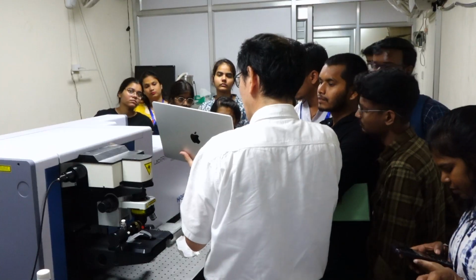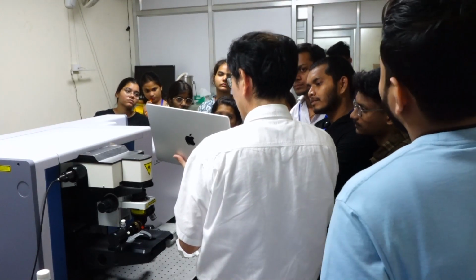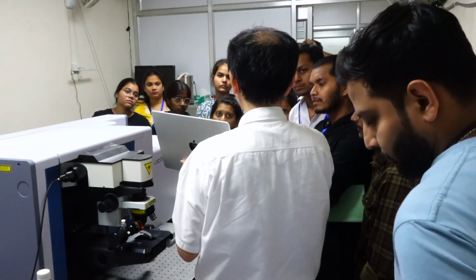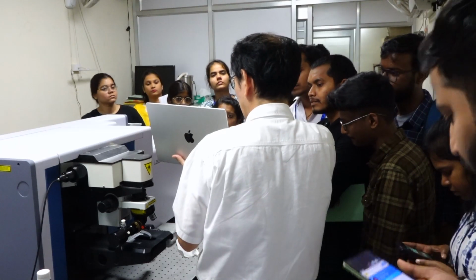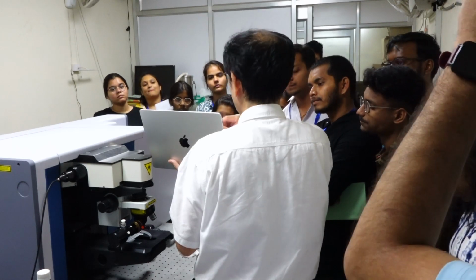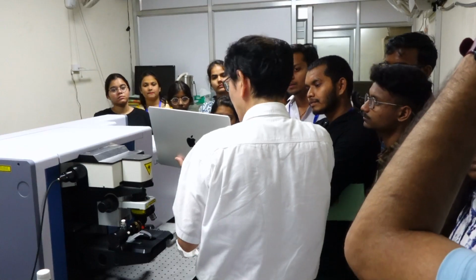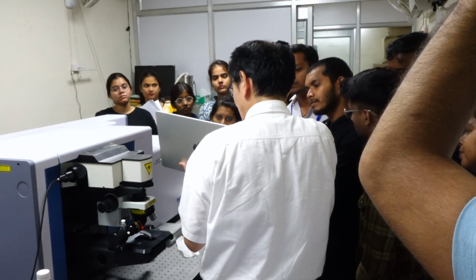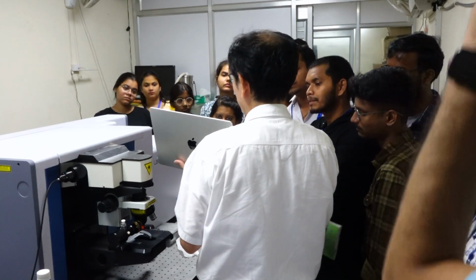Okay, and already we can distinguish the difference between these two sugars. But please be patient for a few hours to get a better spectrum. Then we can discuss what the peak position is, what the bandwidth is, what the intensity is, and under which condition it changes. At present, even if you insist it moves one wave number, the SN ratio is poor, so you cannot say that.